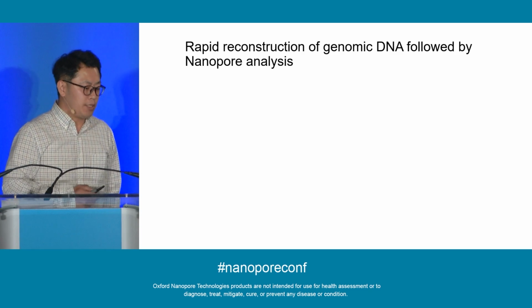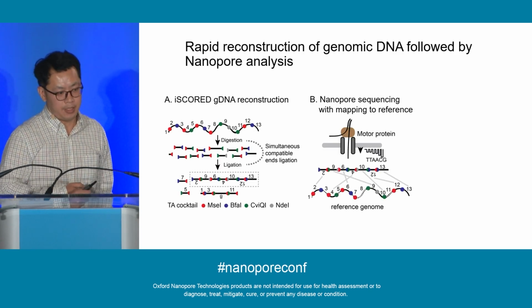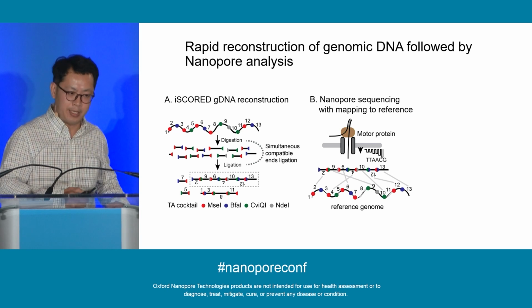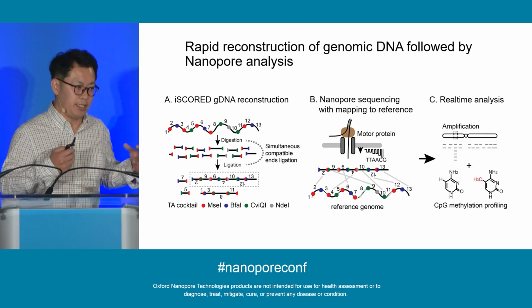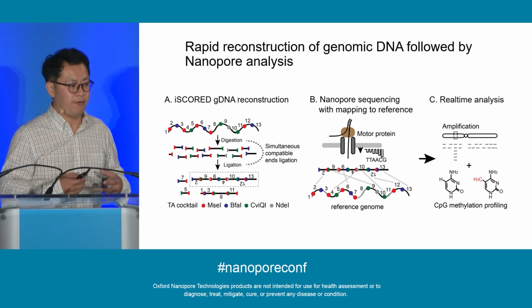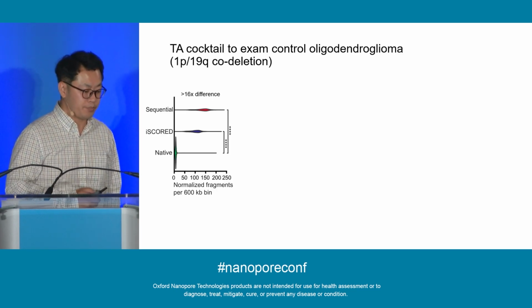So this is our cartoon. We treat the genome with iSCORED, fragment and also reconstruct it, then sequence with nanopore, and analyze to assess the quantitative data and also the qualitative, the methylation data.